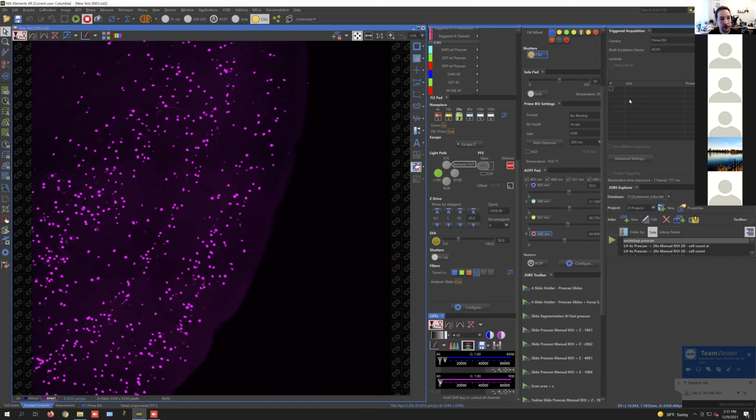And I guess some of you are thinking, okay, but I want to do that in 3D. That's also possible. It's a little bit too lengthy to go through in this workshop today, but we have those jobs built on the system, and I'll also upload these to GitHub after the workshop. Along with the recording, there'll be some of these working jobs for different applications, so that you've got a good starting point for some of these more complex jobs.